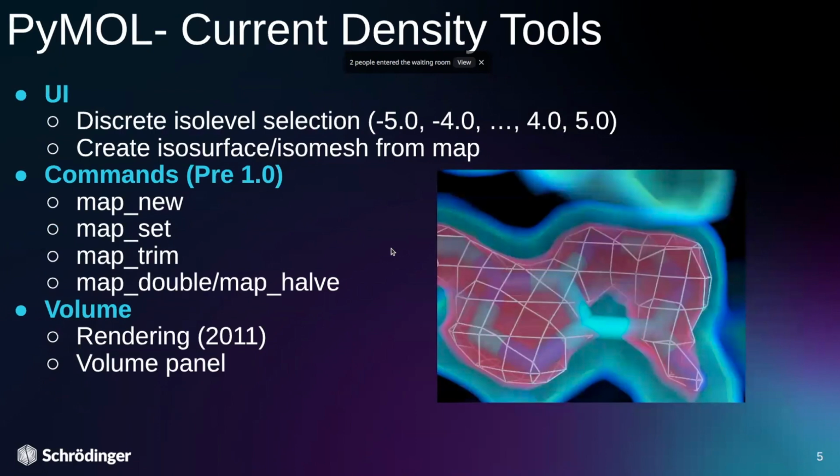Okay, for CryoEM, this has possibly been the most requested set of features that we've received in the past decade or so. It's no secret that while PyMOL has the ability to generate really awesome looking figures, PyMOL has its roots in structural biology. And the needs, as X-ray crystallography has evolved, have evolved even more. A lot of people now are using CryoEM, and these days people are starting to utilize CryoET.